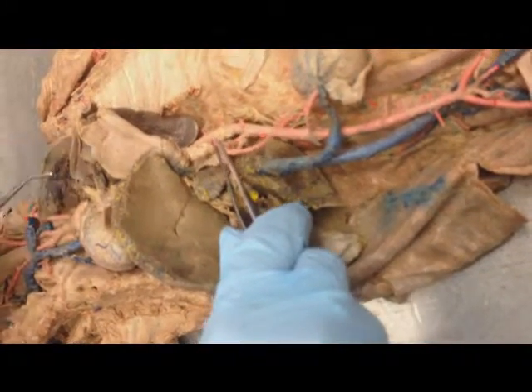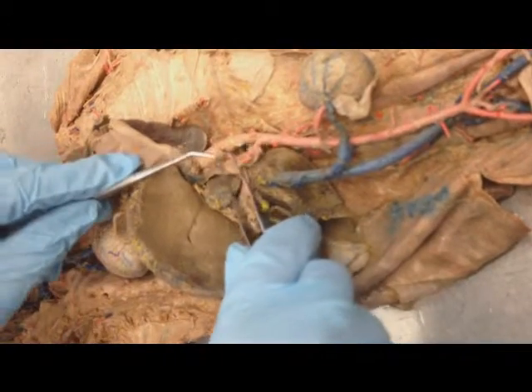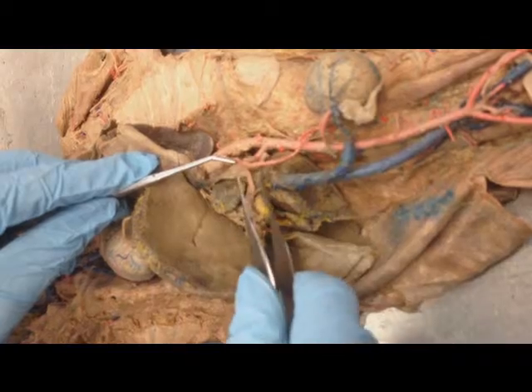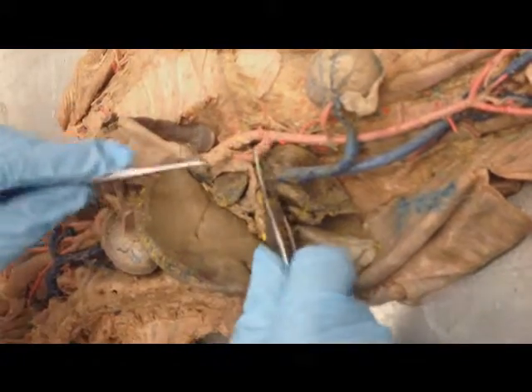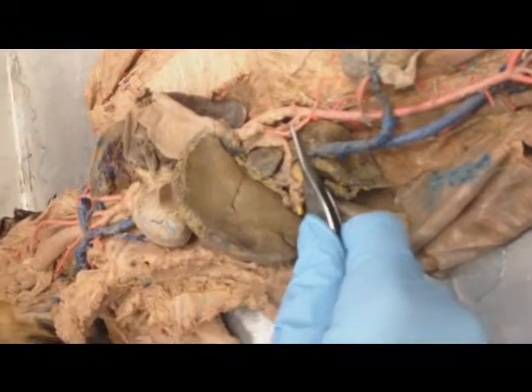This branch, I would say, used to connect to what was the stomach in the cat, and you call that left gastric. This branch probably went to the liver at some point, and we call that hepatic.